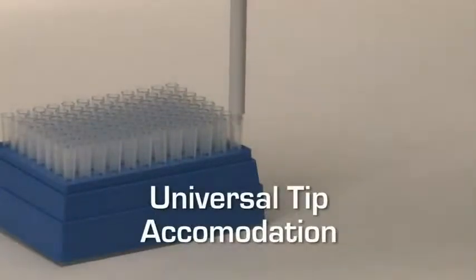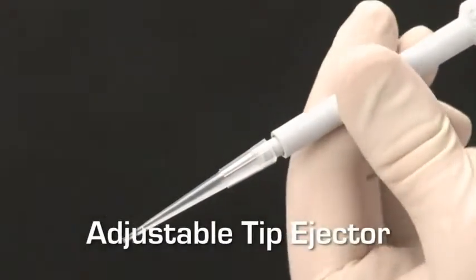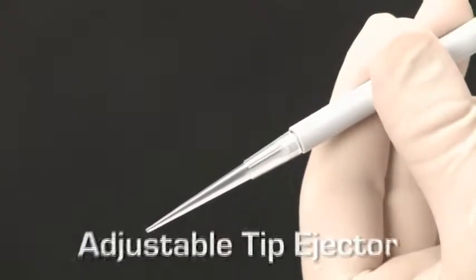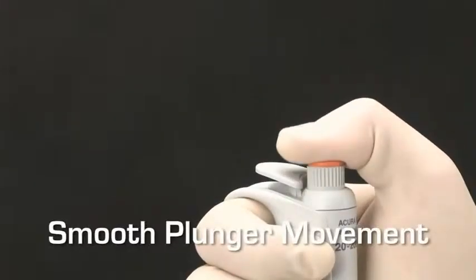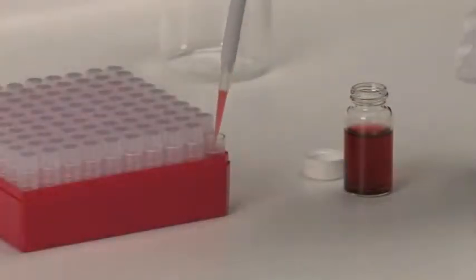Acura Manual Pipettes can be used with most popular brands of disposable tips. The tip ejector can be adjusted by the user so that it's always in the best position for effortless tip disposal.